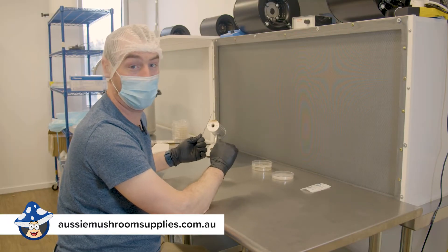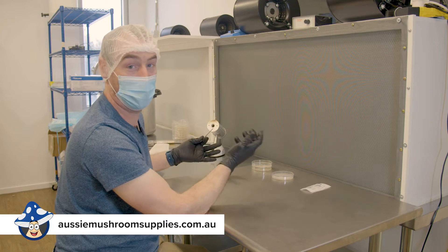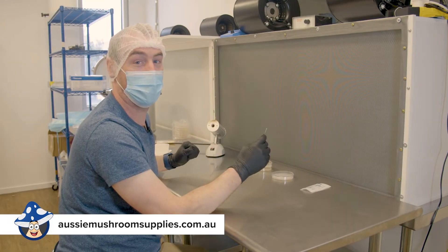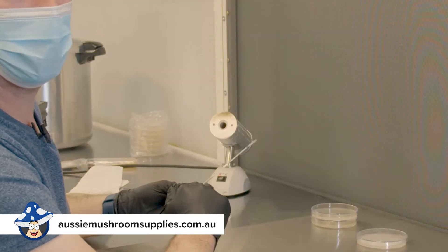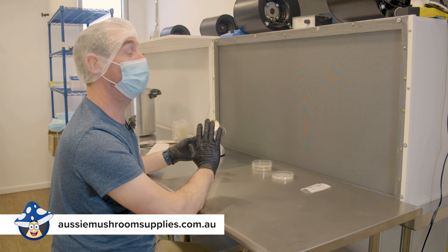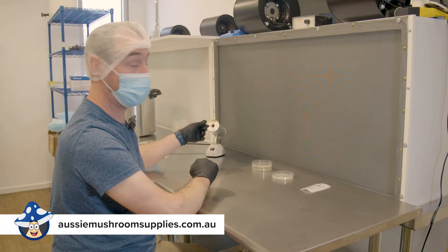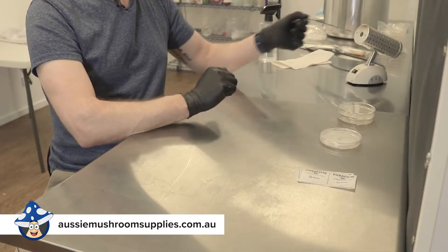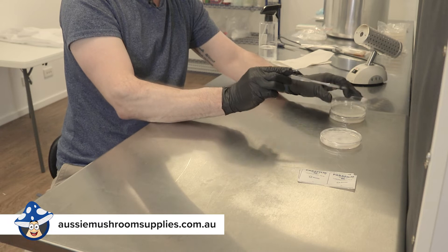We're working in front of a laminar flow hood today. You've got to work in a fully sterile airflow, otherwise other spores and things will land on the agar plates and out-compete your mushrooms. We've got our tool sterilizer over here — this sterilizes our scalpel and gets to about 500 degrees, so for the love of God don't put your finger in there. It only takes about three or four seconds to get it really hot, and then we'll cool it down in our receiving agar plate.